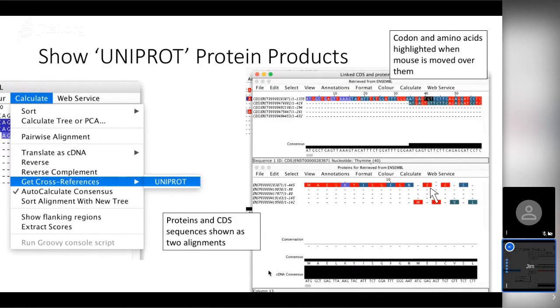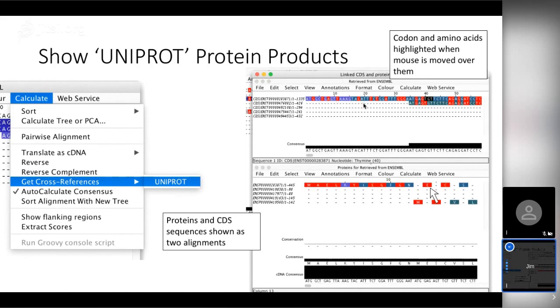The next thing is to go to the Calculate menu and select Get Cross References, then select Uniprot. This is another database Jalview can talk to. When you do this, Jalview retrieves the protein products for the gene you're looking at and trims down the transcripts to show just the coding sequences corresponding with the protein products. This is a slightly different view because these are actually two alignment windows stacked on top of each other — when you scroll the alignment horizontally in one view, the other one keeps track as well. If you select sequences in one view, the sequences are selected in the other.